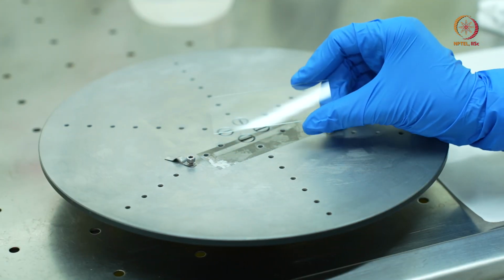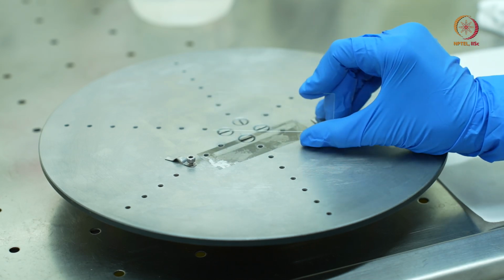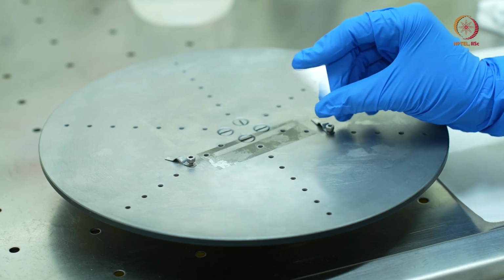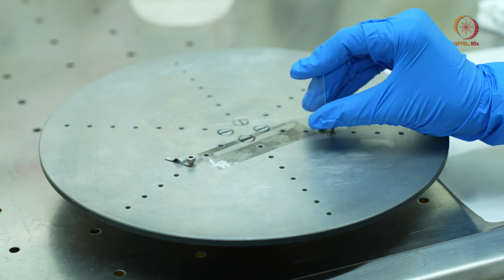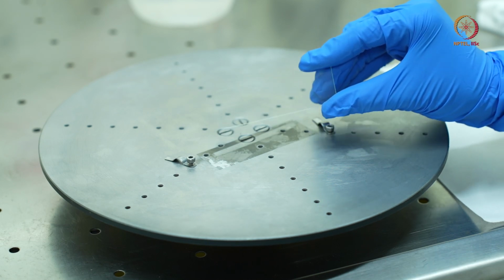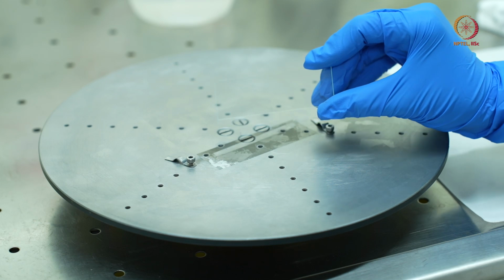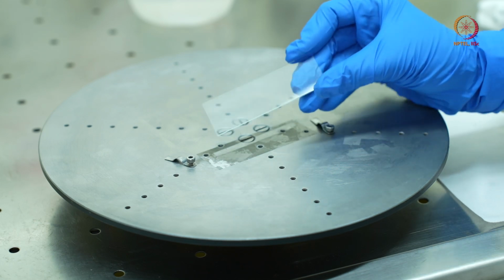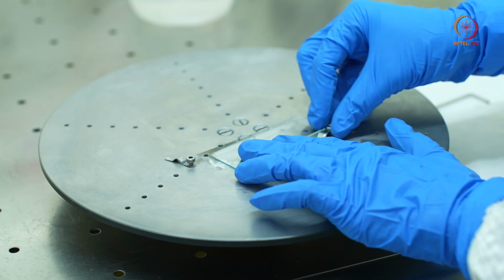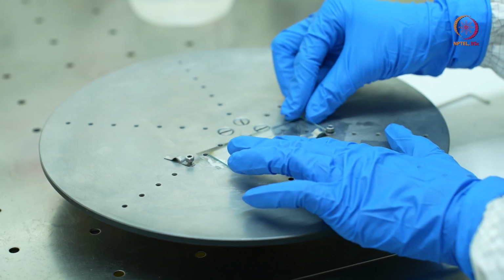So this is a glass slide on which we'll be depositing the tungsten, and as you can see, it is a transparent slide, and I have cleaned it using IPA, acetone and DI water, and I have given it a nitrogen blow so as to dry the slide. Now it's time to load this slide, and these are the clamps I'll be using to hold my sample.